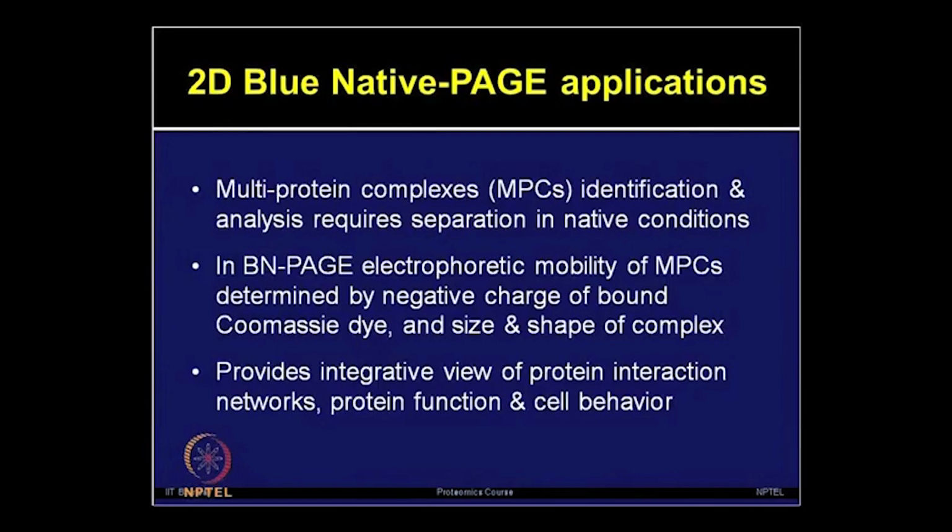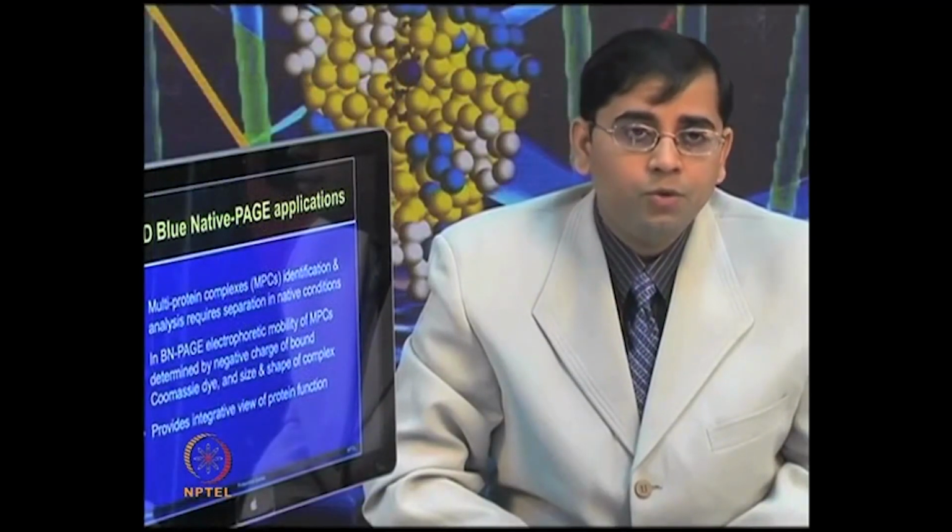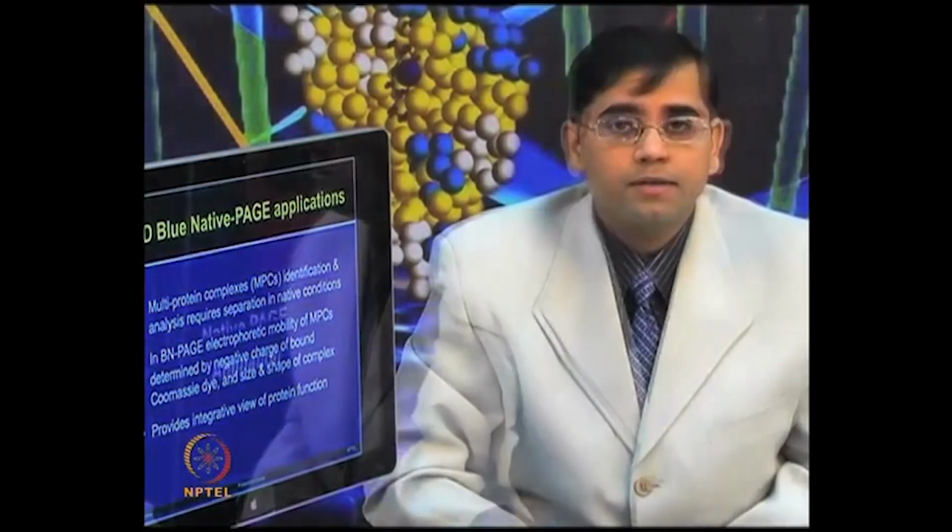In blue native PAGE, the electrophoretic mobility of MPCs is determined by the negative charge of bound Coomassie dye and the size and shape of the complexes. So, this technique can provide an integrated view of protein function.